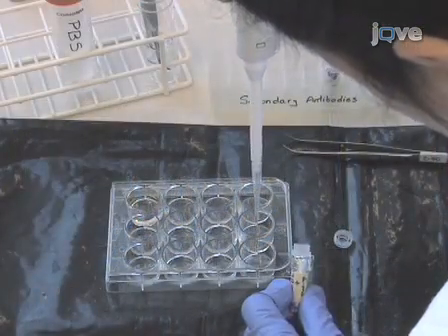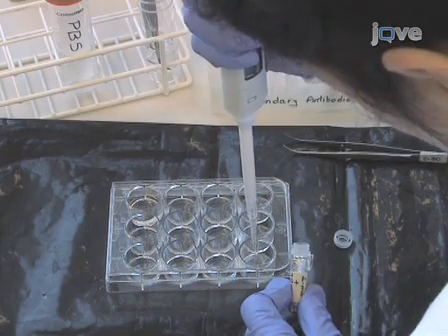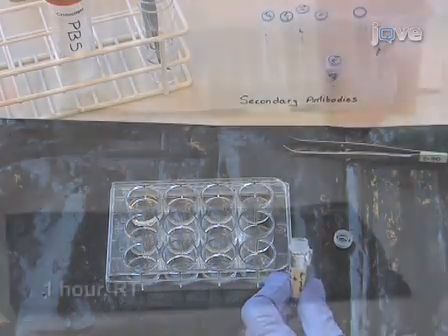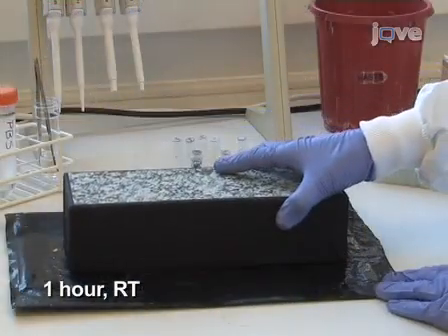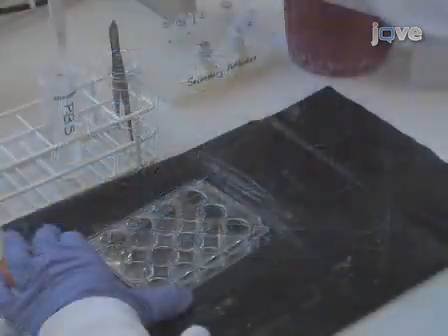Next, add the appropriate secondary antibodies conjugated to different fluorochromes diluted in 1% BSA PBST. Incubate at room temperature for 1 hour in the dark. At the end of the incubation, wash as shown previously.